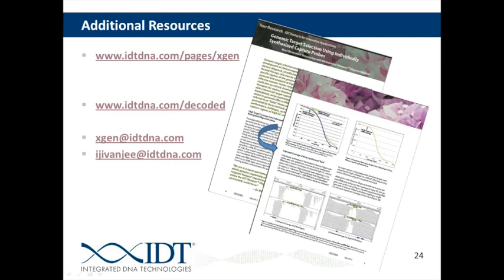So Ibrahim, I'm going to give this question to you. Sure. You've kind of touched on this already, but can you supplement the SureSelect RNA baits with IDT synthesized xGen probes? Yes, you can. In fact, the example that I showed earlier in the presentation was an RNA-based capture technology using RNA reagents. The only caveat I would say is that when you're using RNA-based reagents, you just want to ensure that the stringency of your wash buffers is not too high for targeting anything below 30% GC.